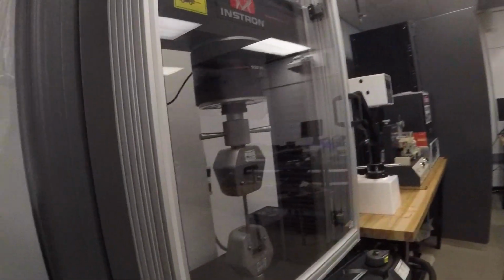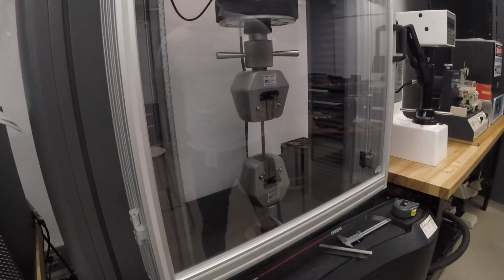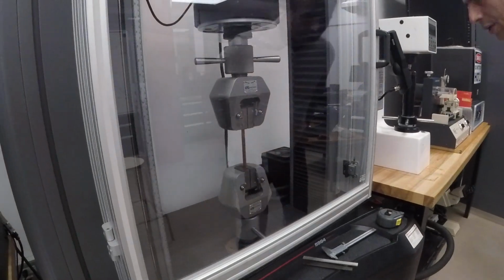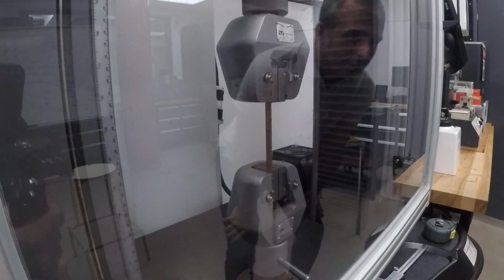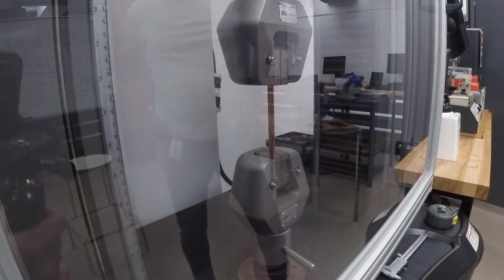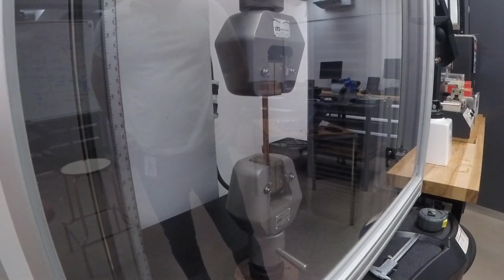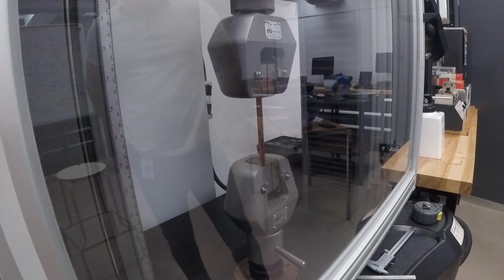Now if we switch to our sample here, if we check from the side cross-section area, it is on max based on the graph, meaning we haven't entered the necking. It is on plastic region because it is copper.